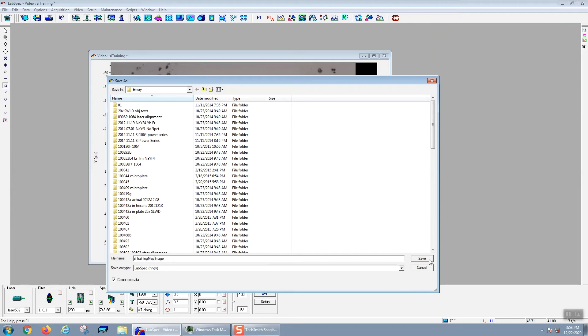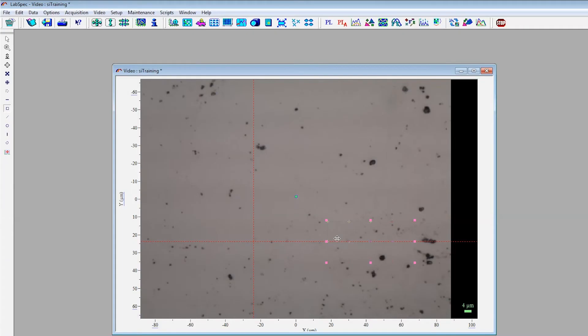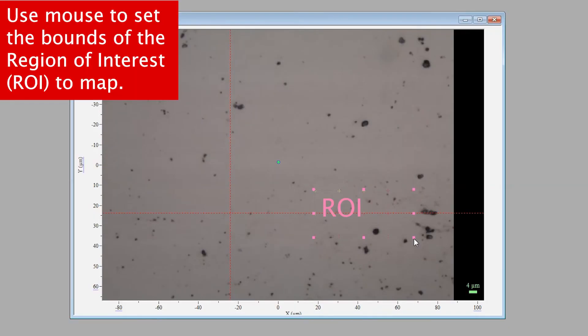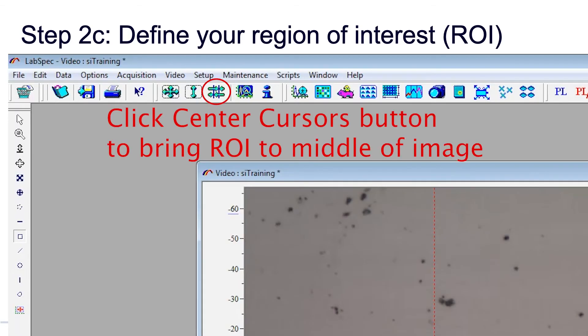Next, you'll use the square icon on the left-hand toolbar to generate a region of interest. This is the area that you'll map. You can either use the square, a circle, a line, or a diagonal line. Whatever the shape is will define your mapping region. Once you see this ROI, you can use the mouse at the corners to move the region of interest into the area. If you don't see the ROI on your screen, you can click on the center cursors button and that will bring the ROI to the center of your image.